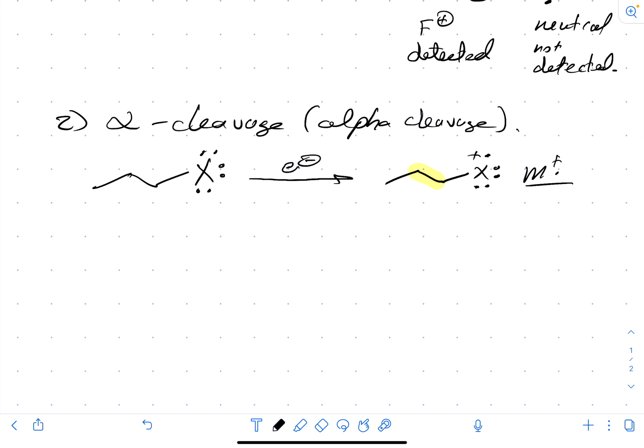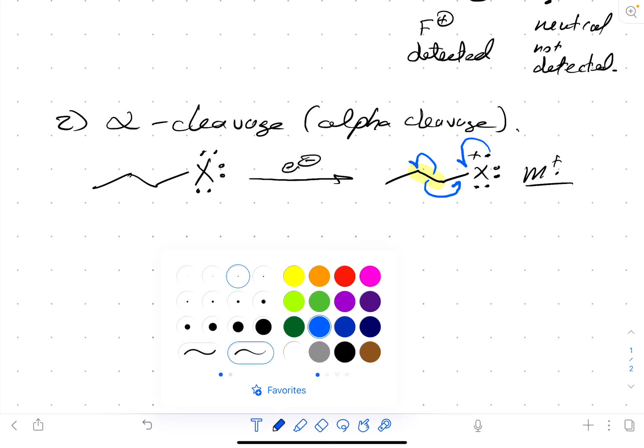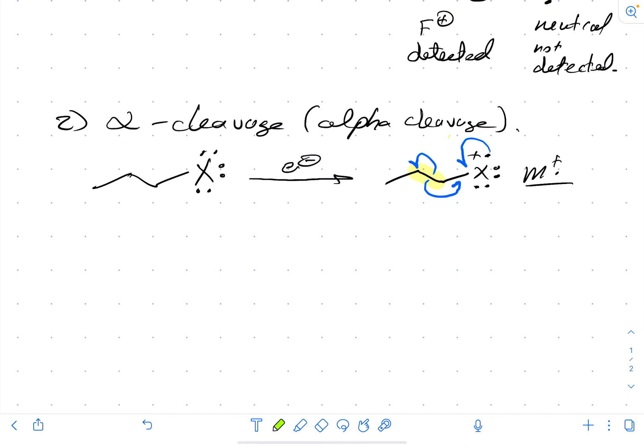And so we're going to move some electrons using single electron processes now. Here's how the arrows will look to cleave this system. We'll take that single electron from the radical cation, we'll dump it in to form a new bond, and we'll form a carbon X double bond by stealing one electron from that highlighted bond, and we'll move the remaining electron over here onto that carbon. If you're careful about what you're looking at, what these arrows are doing is rupturing this bond that's highlighted in yellow, and that's where we're getting the fragment pieces. So if you follow those electrons, what I'm going to get on the right hand side is an X species where I've formed a new bond at that carbon.